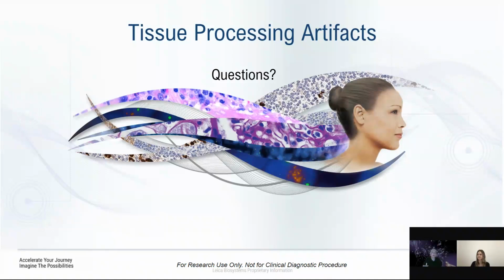For sure. One of the areas of tissue processing that we'll never get away with heat, and I know everybody probably understands this, is your paraffin. But we can monitor the temperature at which we do infiltrate with paraffin. And there's different flavors of paraffin, I say, and it depends on the degree of plastic that's present in the paraffin. You can just look at whoever you purchase it from, they will have recommendations as to the paraffin temperature.